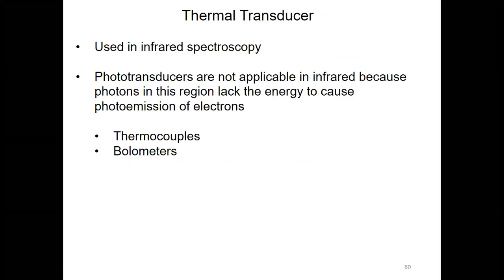All right, now let's move to thermal transducers. Let's quickly go through the thermal transducers. At the very beginning we discussed that they use heat to generate the signal.